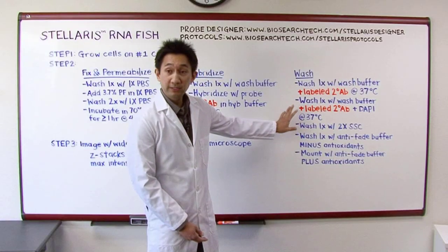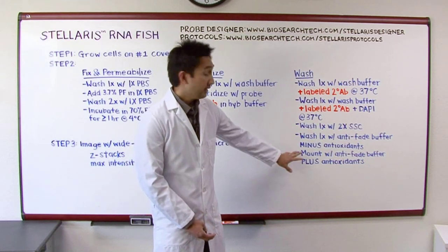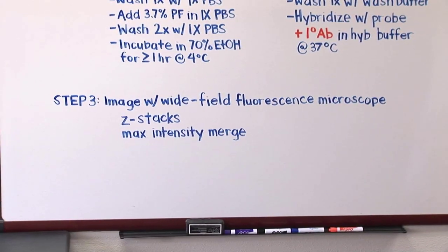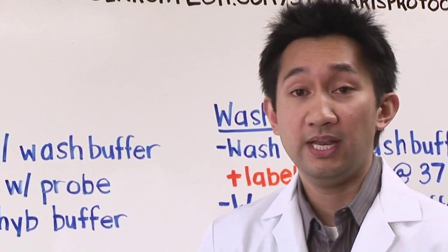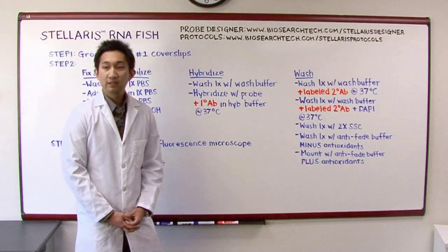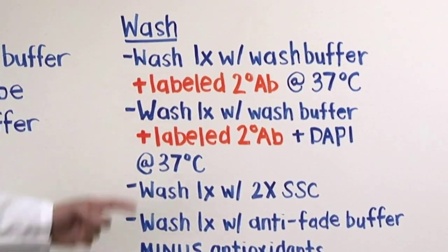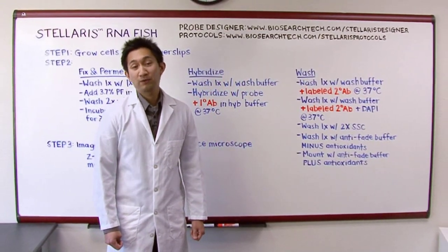So after some additional washes, the cells are mounted on a microscope slide with antioxidants. Lastly, the cells will be taken to a wide-field fluorescence microscope where we'll be taking Z-stacks of our mRNAs such that every mRNA is in focus and later do a maximum intensity merge. So the only difference we see with this Stellaris FISH protocol is what we see in orange. So now that we're done here, let's go over to the lab bench where my colleague will perform the assay.